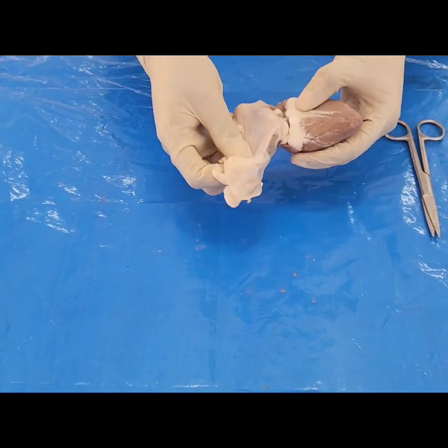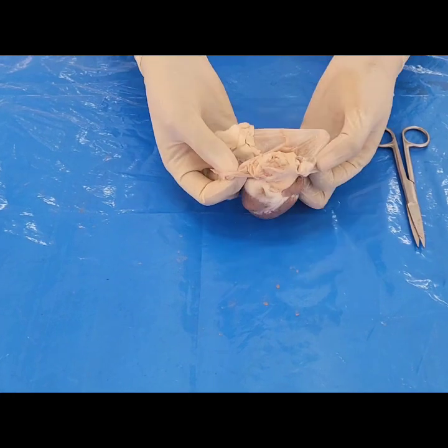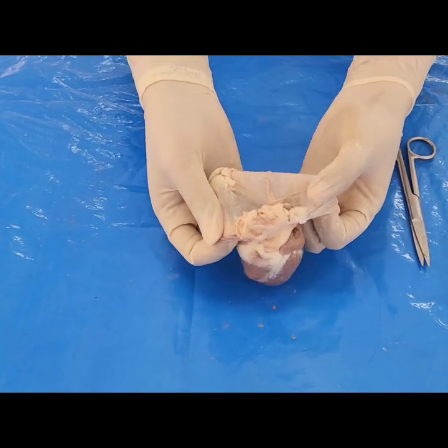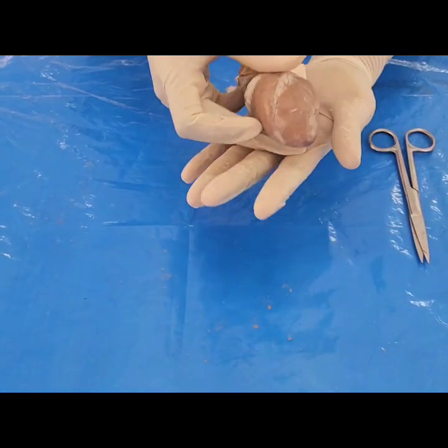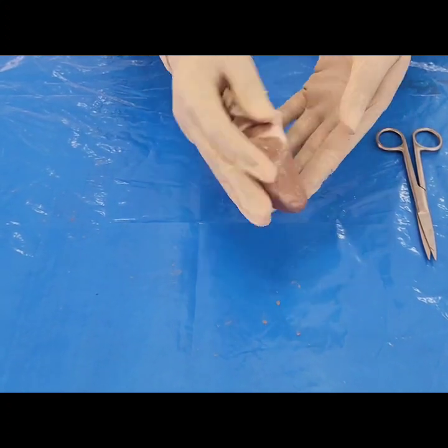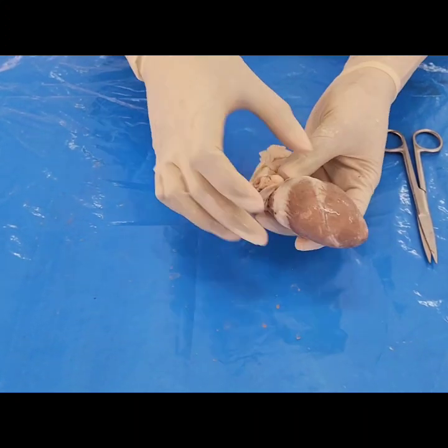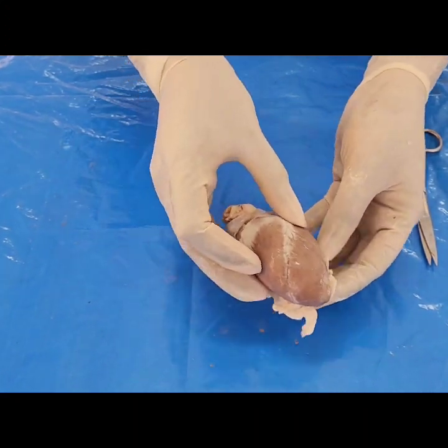So it is encircled. The base and the apex of the heart, everything, is covered by the pericardium. So we have removed the pericardium. And now this is the sternocostal surface of the heart, and this is the diaphragmatic surface of the heart, and this is the base of the heart, and this is the apex of the heart. Okay, this is about the heart of a goat.